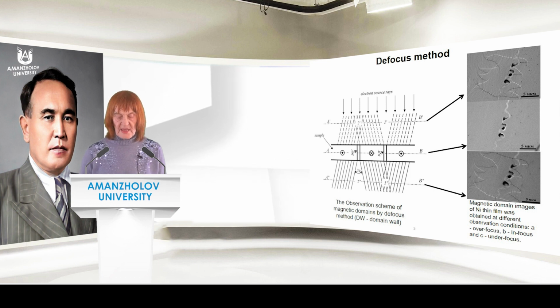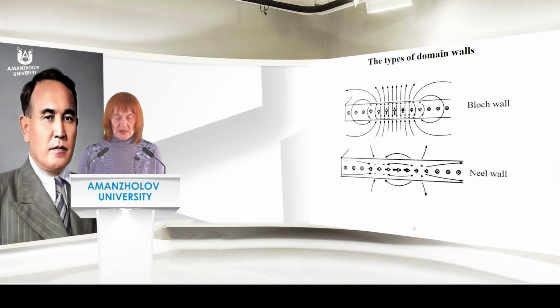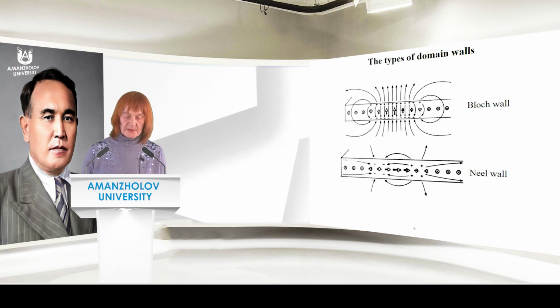The picture shows that magnetic contrast is absent at in-focus condition. The picture shows the same area image of the nickel thin film with reverse magnetic contrast, A2'B2' plane.